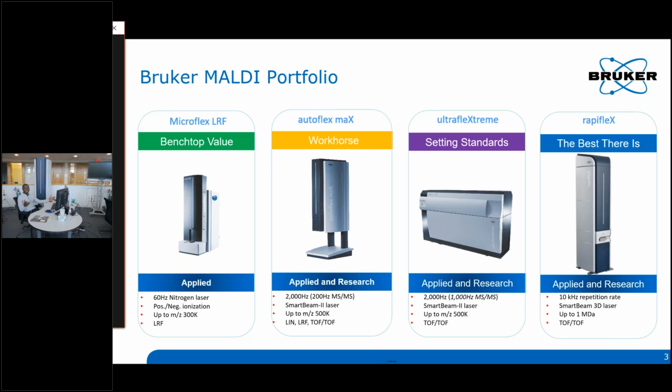These are higher specs, higher speed instruments. Mainly the Ultraflex Xtreme. This is our gold standard for polymer analysis. So for synthetic samples that are usually harder to ionize, are usually harder to see by MALDI, or that require very harsh conditions to be able to ionize, that's when you would need the Ultraflex Xtreme. Of course, slightly higher resolution than the Autoflex.